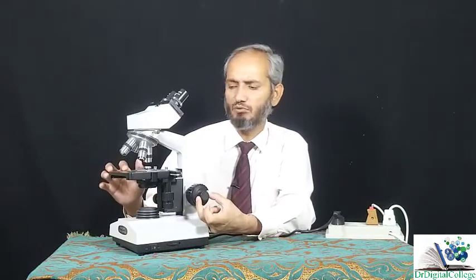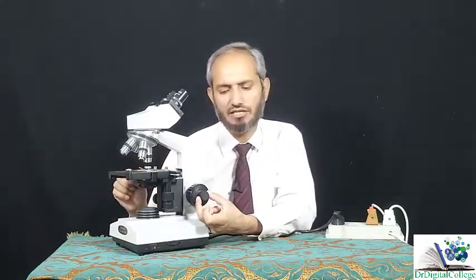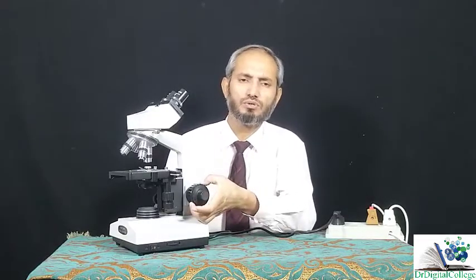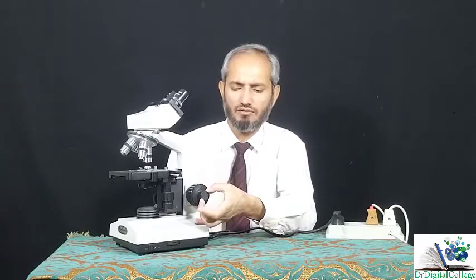The stage is moving, but you cannot observe it right now because the movement of the stage is less than a millimeter. Very slightly, the stage is moving down or moving up. This knob is called fine focusing. This knob is called coarse focusing. And this knob is called fine focusing.